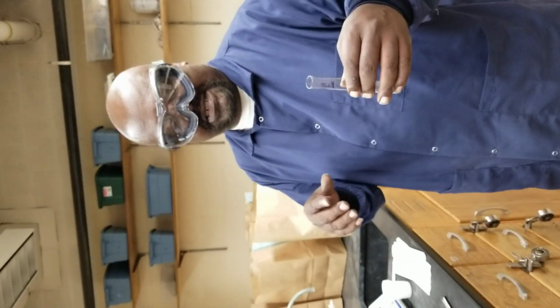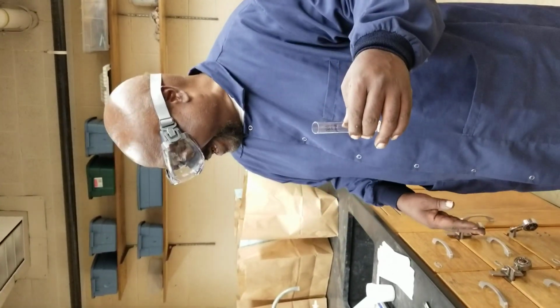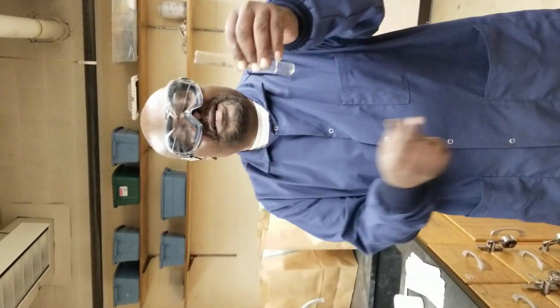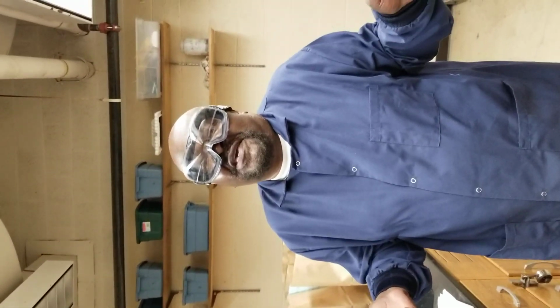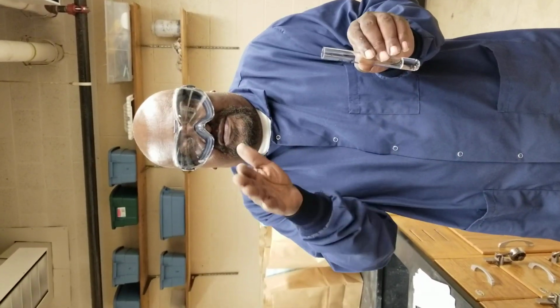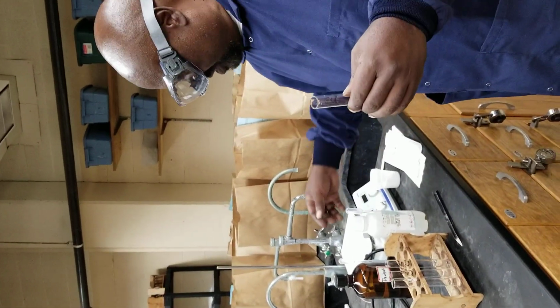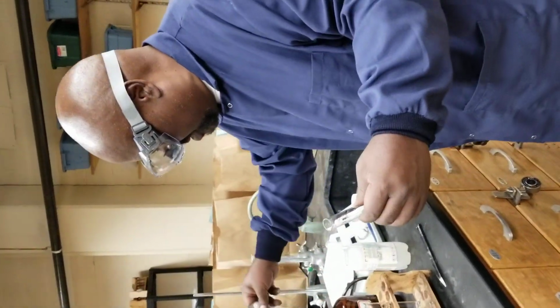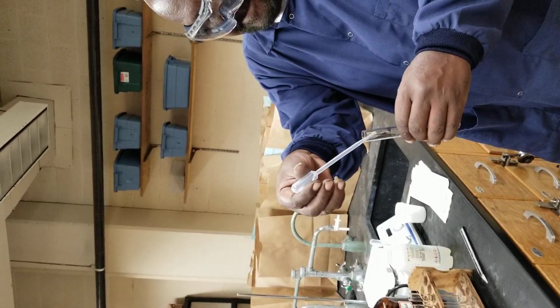Right, so in my last test, I kind of messed up a little. Oh Lord. I thought I had cyclohexane in the bottom and then I was adding water. But actually we have water down here. Go figure. Pray for me. So water down here, that's the solvent, and we are adding various things, beginning with the same, pentane in this case. Again, dripping.